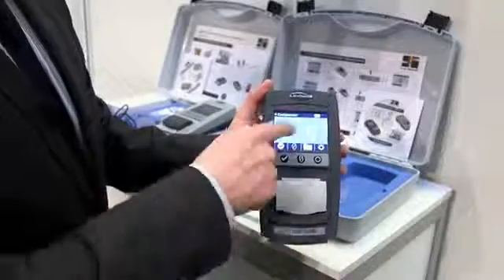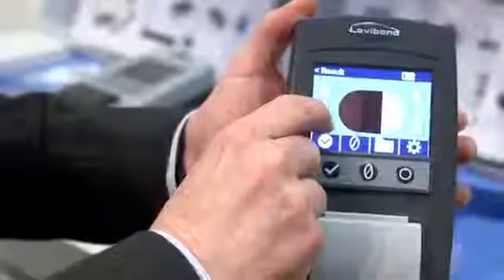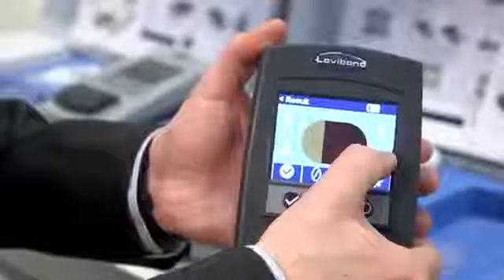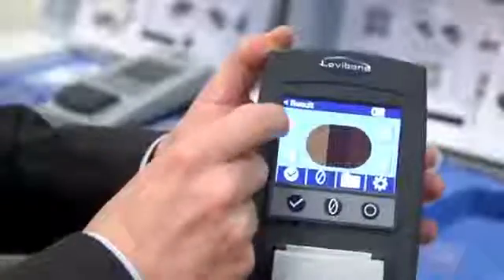We're averaging 25 readings so we get a very good, very stable, very accurate set of data, so we know the unit will be reliable and comply with the standards. What I get on screen is the number relating to my standard, but the clever bit is the comparison screen. If you're familiar with a comparator, the on-colour screen will be very familiar to you, and as with the comparator you can scroll through the options.